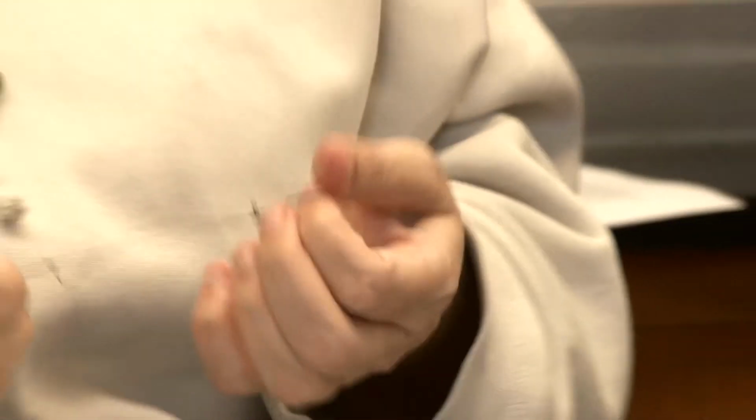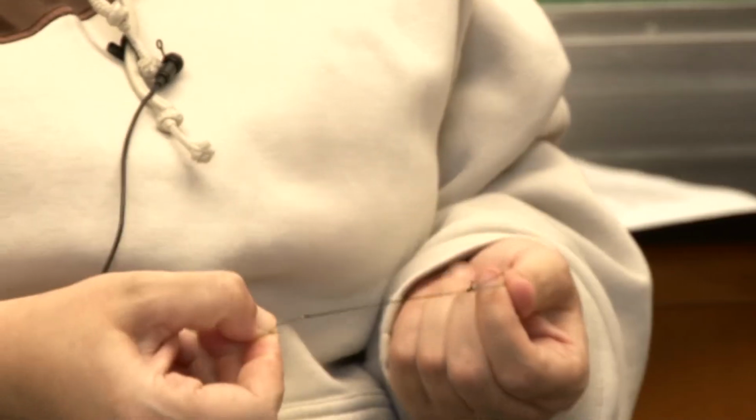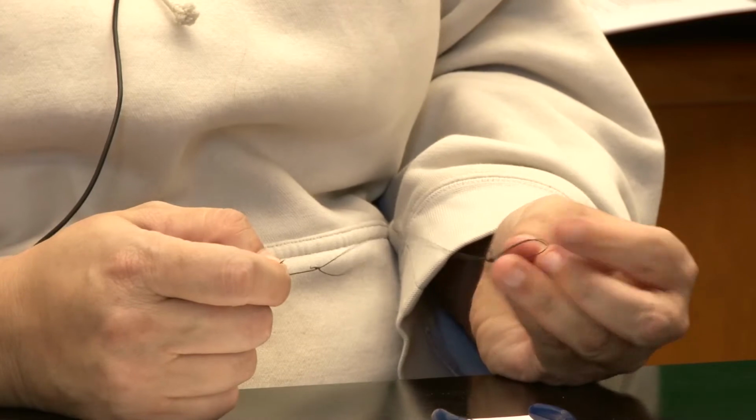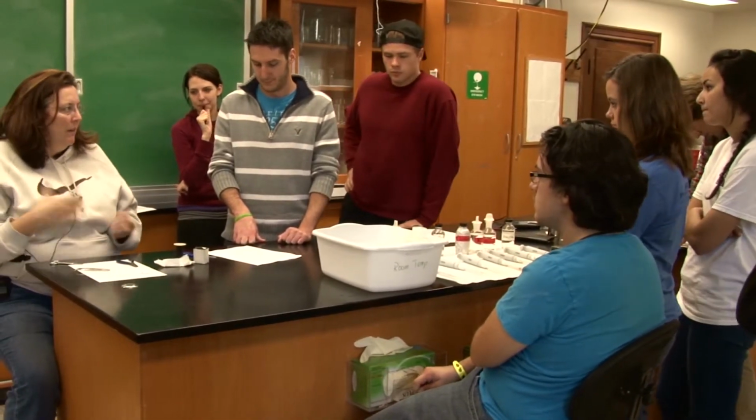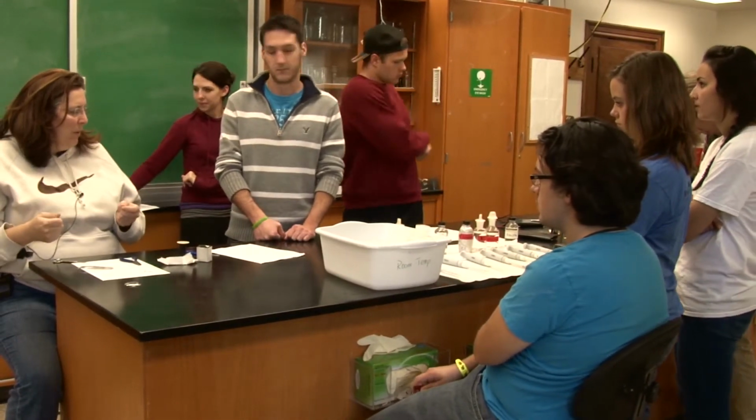Okay, so you need to make sure that you have 6 of these ready, prepared for the students, so they can pin their heart with it. Okay, so once we're done with the dissection, I'd like each of you guys to make one so you can practice, but also so we can start the week with extras. All right, and that way, hopefully, it won't be a big burden and you won't be scrambling in the morning.